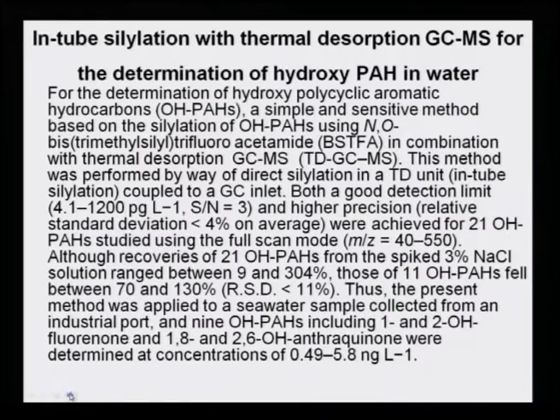Both a good detection limit, that is 4.1 picogram per liter sensitivity, and very high precision were achieved, and almost 21 such hydroxy polycyclic aromatic hydrocarbons were studied using a full scan mode, that is the m/z from 40 to 550 AMU was covered by this particular machine organization.